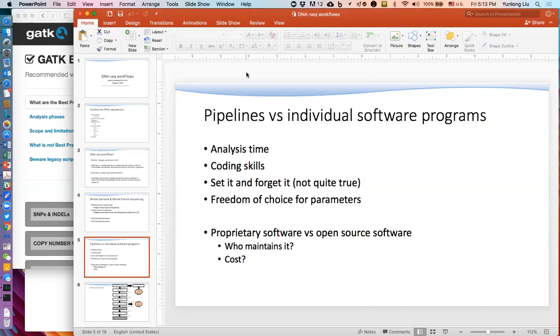So my advice to you is once you start a pipeline, it's not the set it and forget it, the old method of, oh, it'll just run by itself. Please come back and continuously check it, because you can get days into the analysis and it stops. Now, there are multiple reasons why a pipeline could stop. Pipelines in general that are written at academic institutions link open source software. There are some inherent problems with open source software.